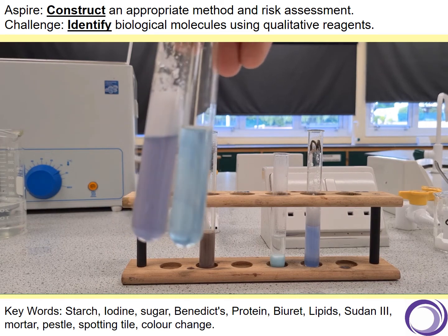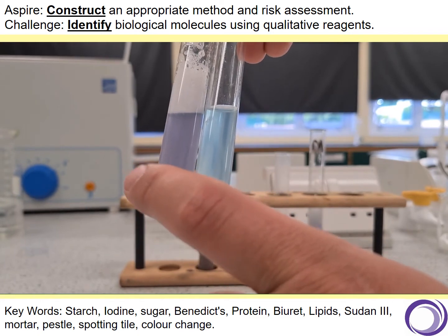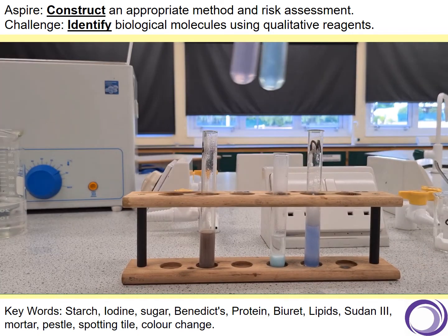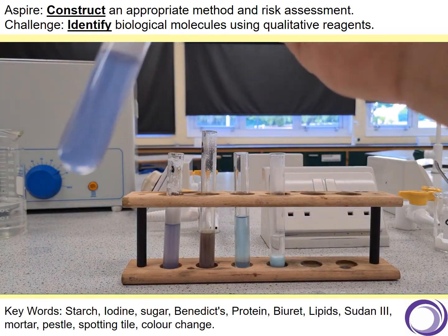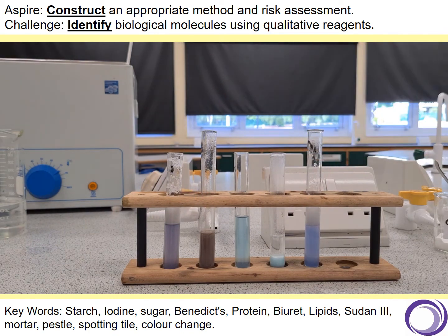So that is your colour change. It goes from this light blue here to this purple colour here, and that shows you that the food has protein. Now if you look just very quickly, this milk has a little bit of protein in it. It has got a purple colour, so it does have protein in, but I'd expect that from milk as well.